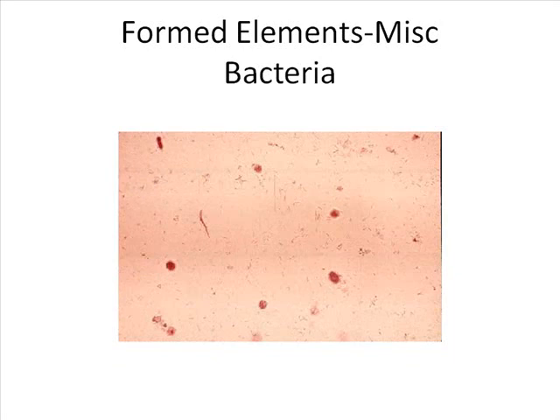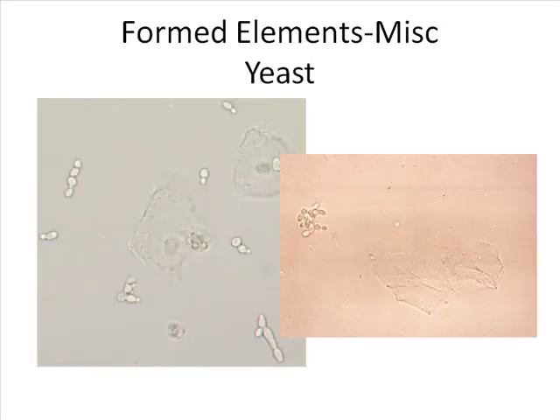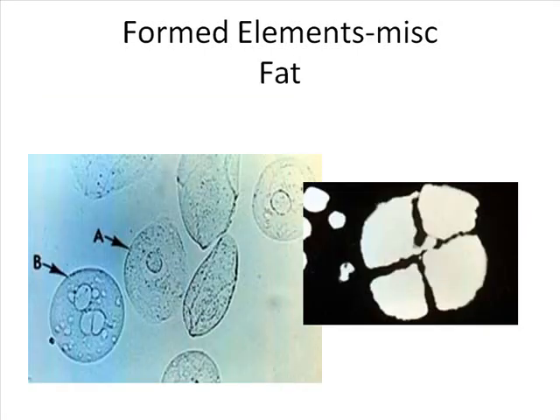You would have to do a gram stain in order to determine exactly what it is. It's where you would do a culture. Look for the budding yeast, and here's a big squamous epithelial. And note too, when should you really look for yeast? With a positive glucose. Usually patients that have positive glucose, you'll see yeast, because yeast love that high amount of glucose.